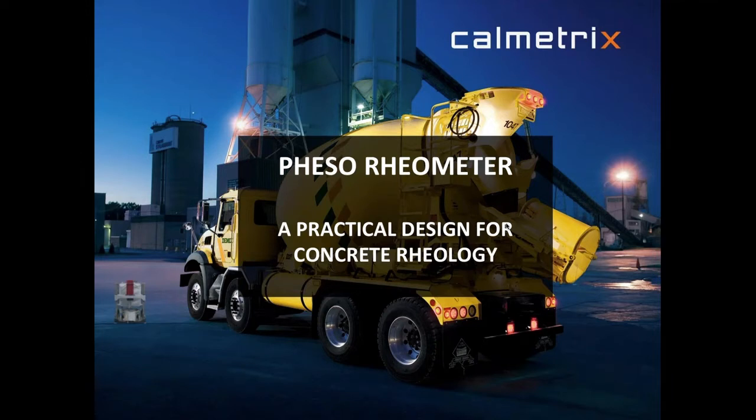Today's webinar is going to build on the first webinar that we did when we introduced the instrument earlier this year. Today we're going to focus more on the design of the rheometer, how it compares to other types of devices on the market, and then go through some new applications that are above and beyond what we used in the first webinar.